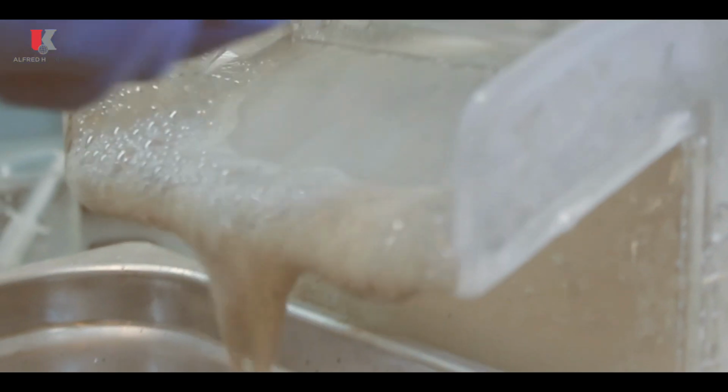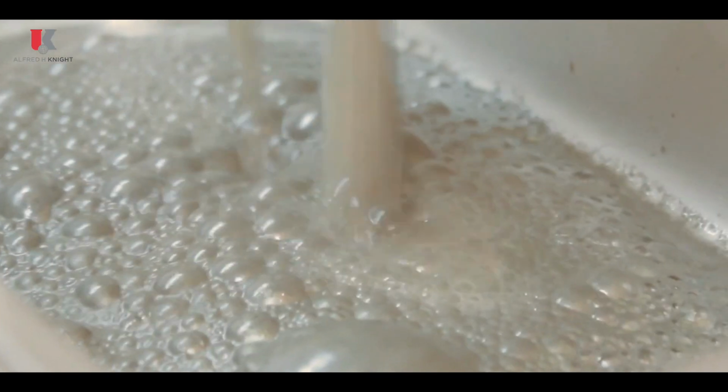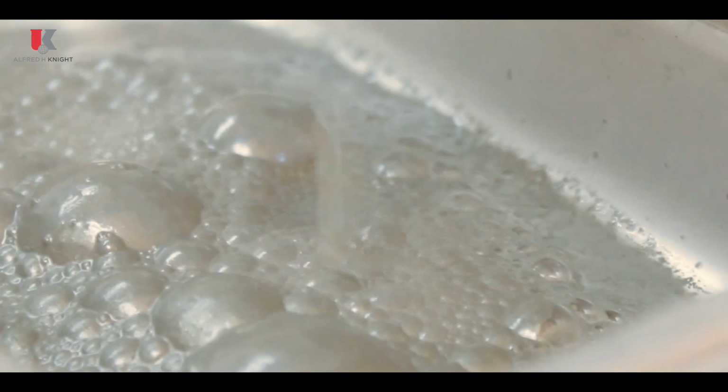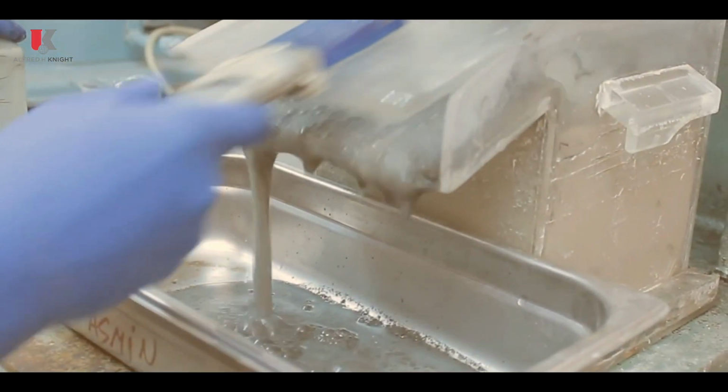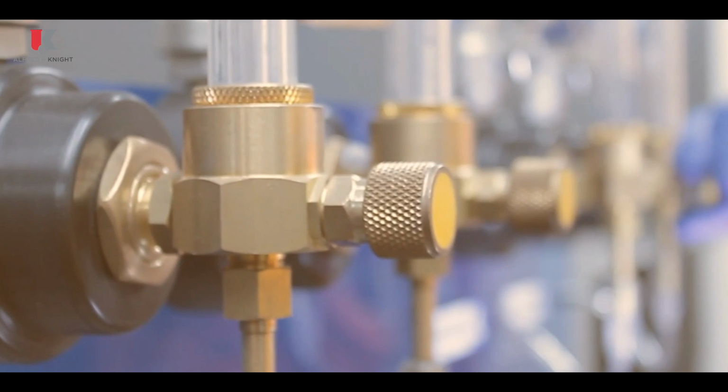Flotation. In this laboratory, flotation tests are carried out, such as flotation kinetics, open and closed cycle tests. In addition, different reagents are tested, dosages, lime consumption is measured. The recovery and collective concentrate grade that can be obtained from a particular mineral is determined.